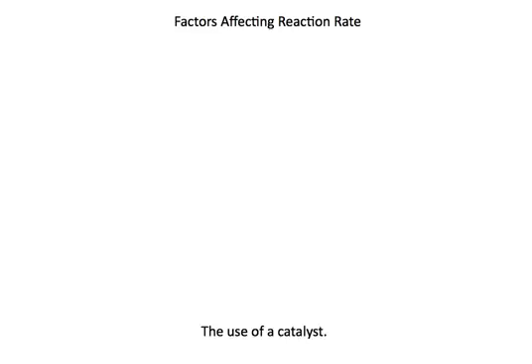The addition of the potassium iodide, that was the liquid that went in the second liquid, clearly acted as a catalyst. It increased the rate of reaction very dramatically, as evidenced by the formation of all those bubbles of gas that got caught up in the dishwashing detergent that was also added there. But again, it was evidence of that catalyst increase in the rate of reaction.